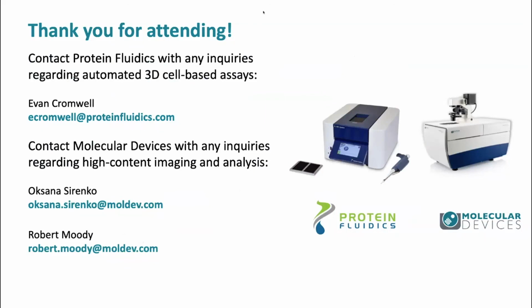Before I answer that, I've seen one question in the Q&A, but for some reason my typed answer didn't go in. The scientist asked how deeply we can image spheroids and organoids. It depends on the nature of those spheroids or organoids, and also what kind of imaging methods were used.